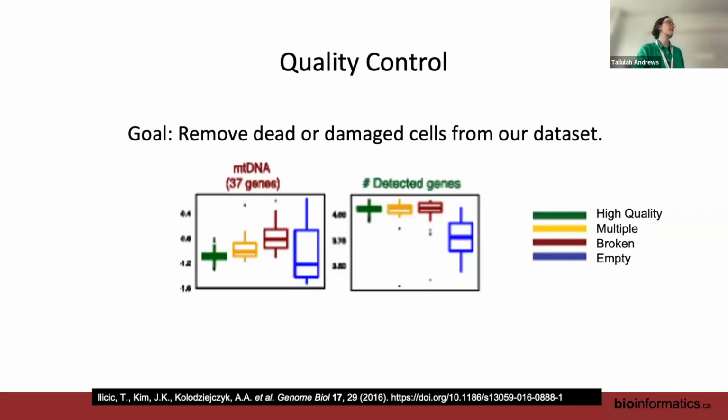That is why we still use those two statistics today. Lots of people make up rationales for why we use them, but we actually use them because we tested all the possibilities and these two work the best. So when we're filtering our data set, we're going to look at the distribution of these two measures across our cells and filter out those with poor scores.